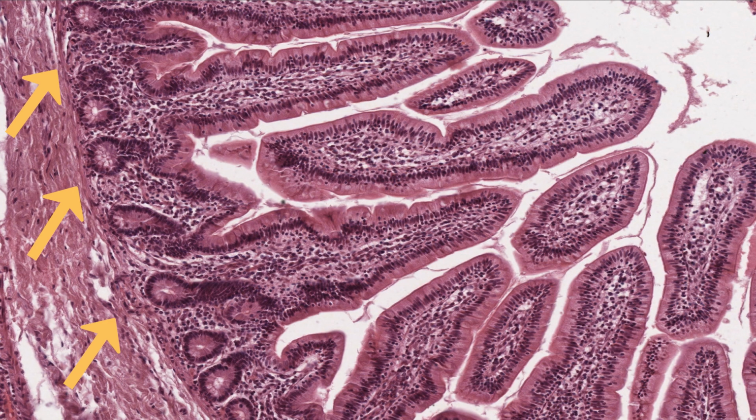This change emphasizes the fact that the connective tissue right under an epithelium is almost always specialized to support the overlying epithelium. Sometimes it's the vasculature or looseness of the tissue or the presence of glands which highlights the distinctiveness of the lamina propria. In this case, it's the abundant protective cell population. The lamina propria is more closely related functionally to the overlying epithelium than the underlying connective tissue.